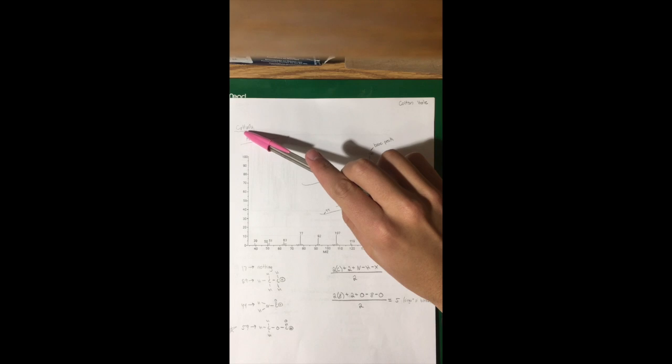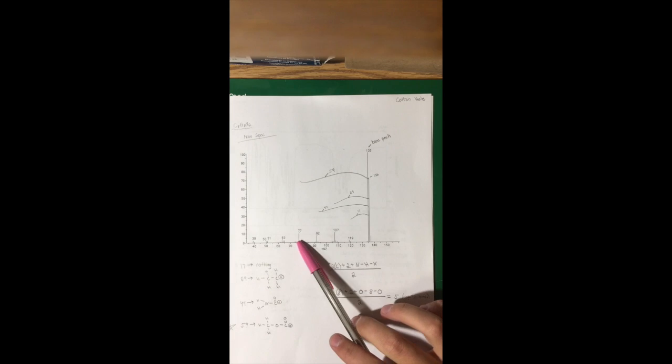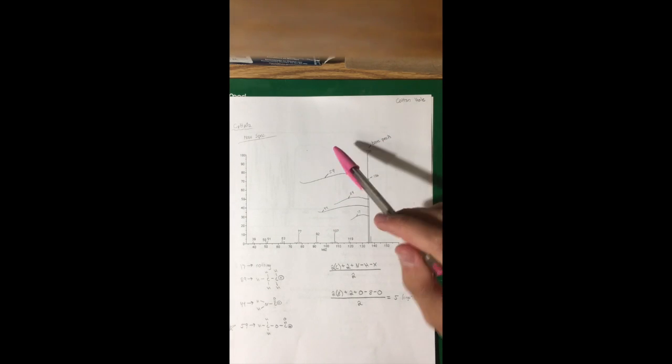Alright, so first we're looking at the mass spec of the molecule again, C8H8O2. We find that the molecular mass is 136, which is what we take all of our measurements from: 136 minus 119, 107, 92, 77. Here, 135 is the base peak. So technically we don't need to go past it, but since everything is past it, we will look into it.